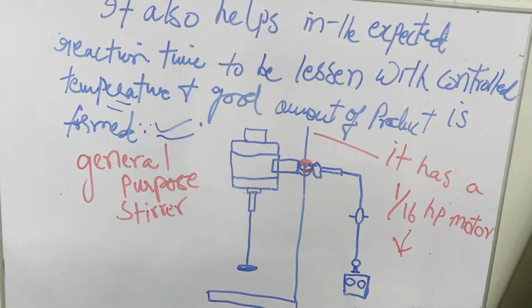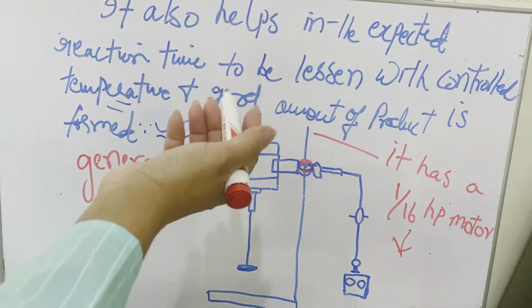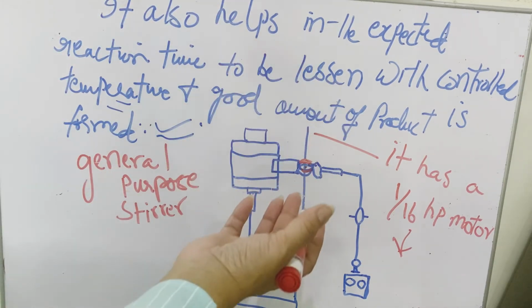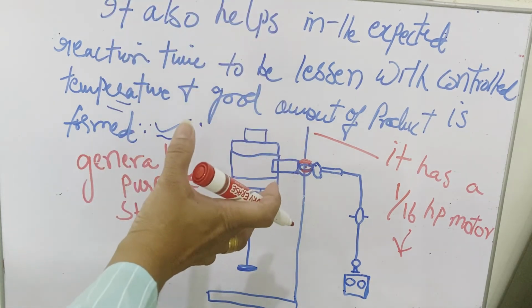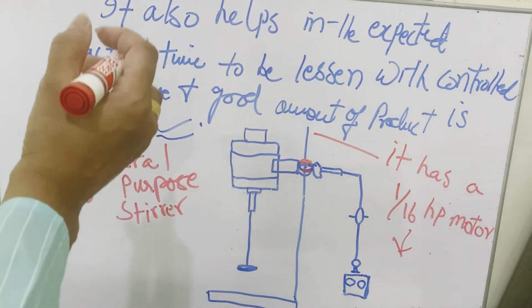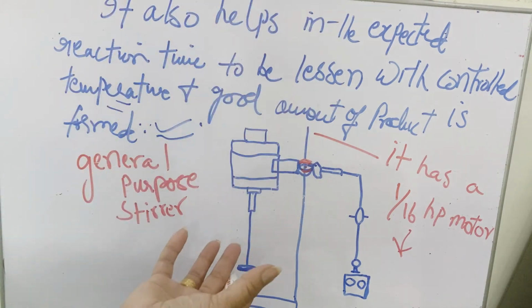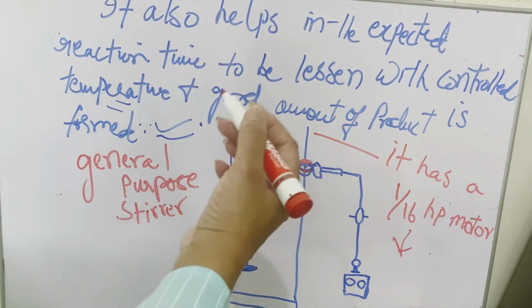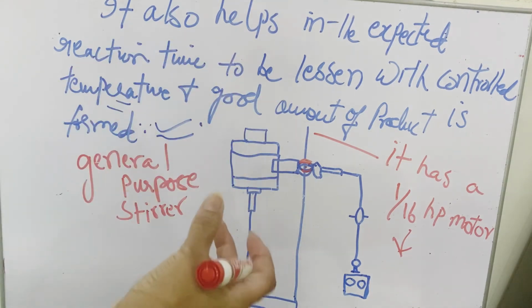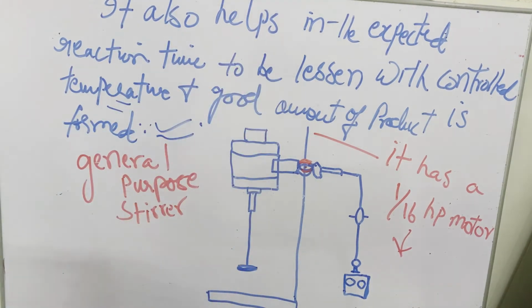Other types of stirrers are also there, like steel ones, which are attached with the help of a screw. The rubber tubings are used only for the glass stirrers, but when you are using the ones made of steel, you need a screw to assemble or fix it.